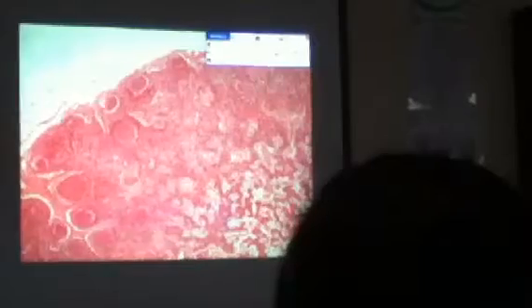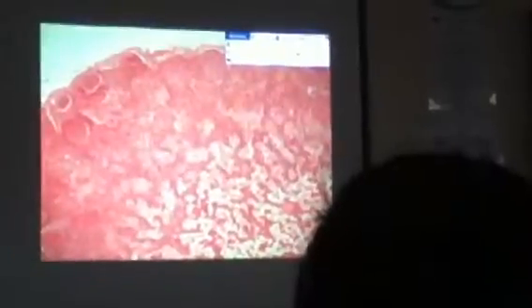The capsule, the subcapsular sinus, and the lymphoid follicles. And then in the medulla, you will be able to see numerous anastomosing sinuses. Because of their location, those sinuses are called the medullary sinuses. Aside from the sinuses, you will also see blood vessels, adding to the soft consistency of the medulla, because the blood vessels contain blood, which is fluid, unlike the cortex, which is full of cells.